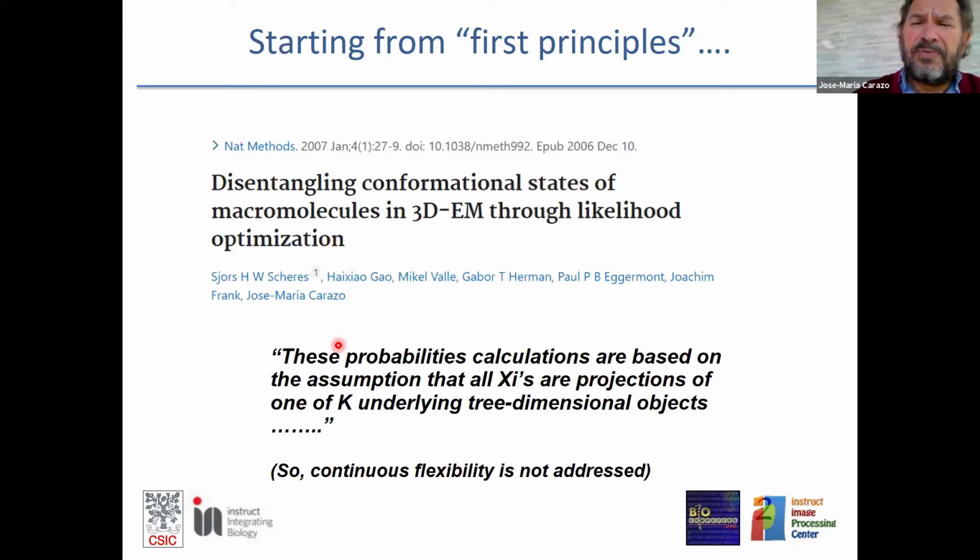The work of Joachim Frank in Columbia is certainly paramount there, and you have seen his results on the ribosome and in other systems. And we are also developing other approaches on our own.